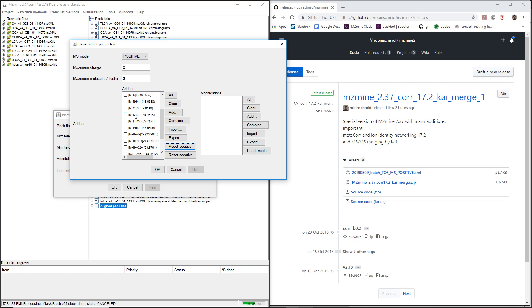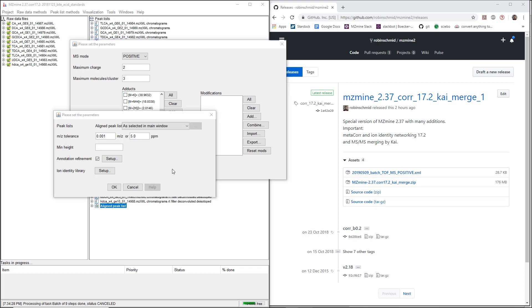We can also go higher with the molecules, the multimers that we expect and the charge, for example.